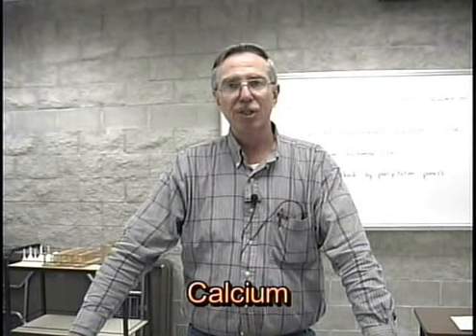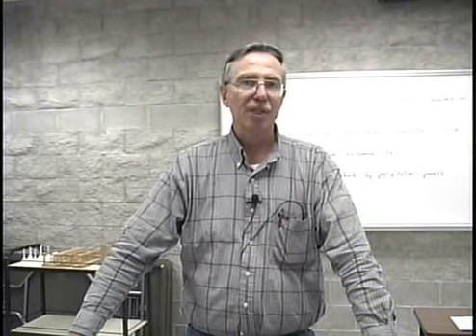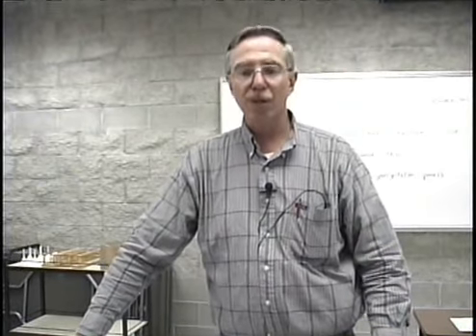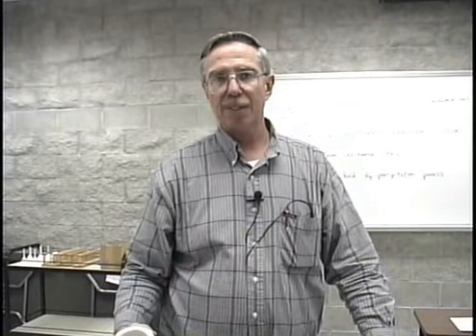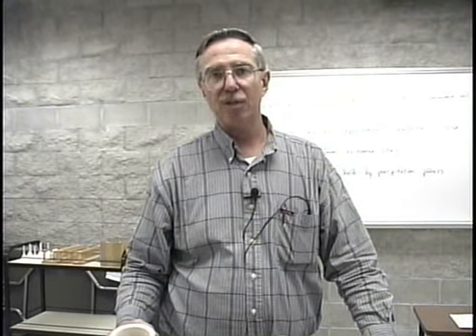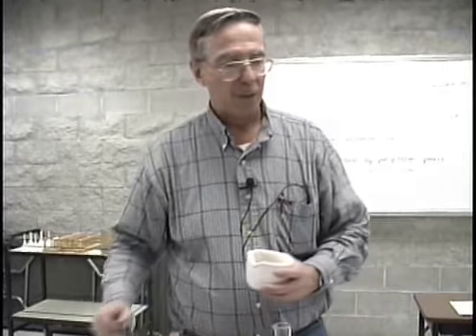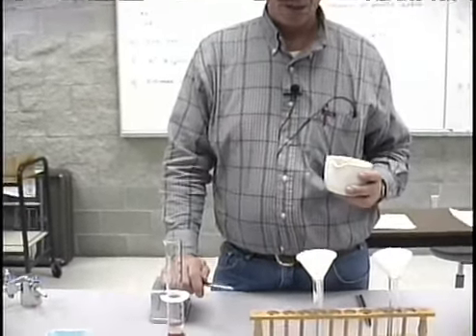Calcium is one of the major elements which occurs on exchange sites in the soil. However, calcium can also occur in a soluble form in the soil solution as well. So in this exercise, we're going to be taking the same acidic clay loam soil that we had before. We're going to remove the aggregates, very similar to what we did in determination of soil pH, and then I'm going to place a quantity of this soil into this setup that you see here in front of me now.